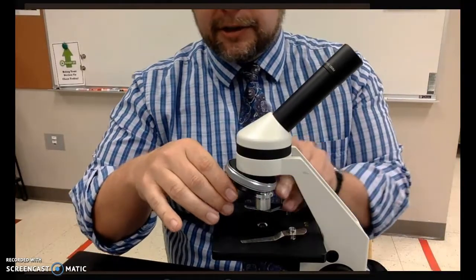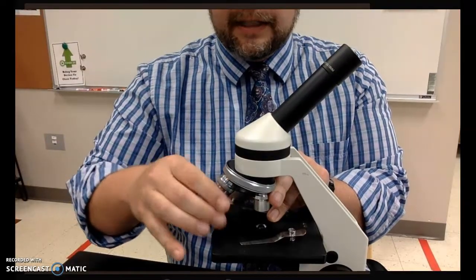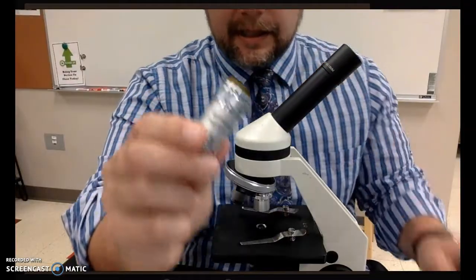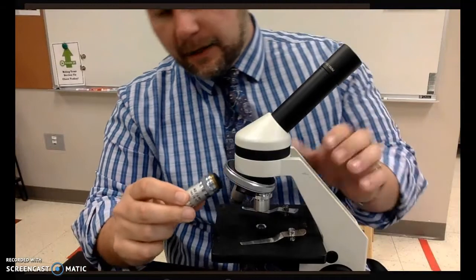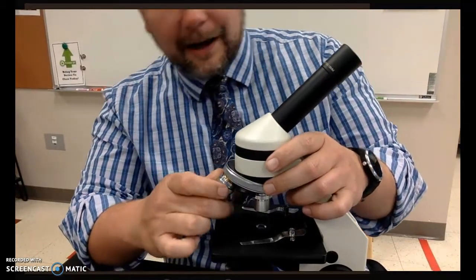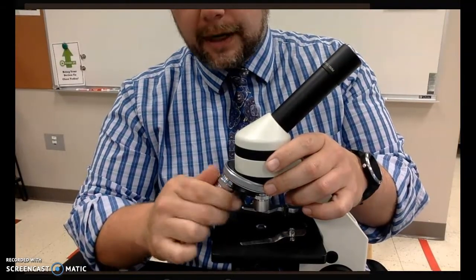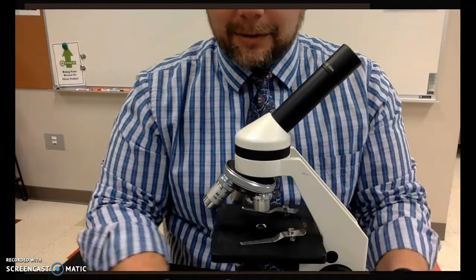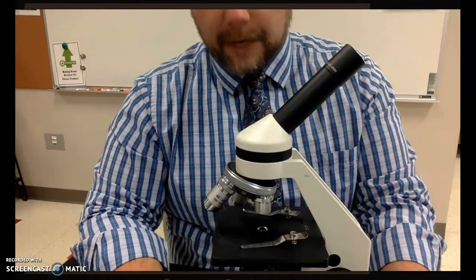Just for a demonstration, I'm going to unscrew the objective lens from the revolving nose piece. And as you can see, it does say 40, which means that it has a magnification of 40x. Now, just because I have done this, I am not going to recommend that you do this in class and ruin your microscope. I'm a highly trained professional. I know how to use a microscope. Please do not remove the objective lenses from your microscope.